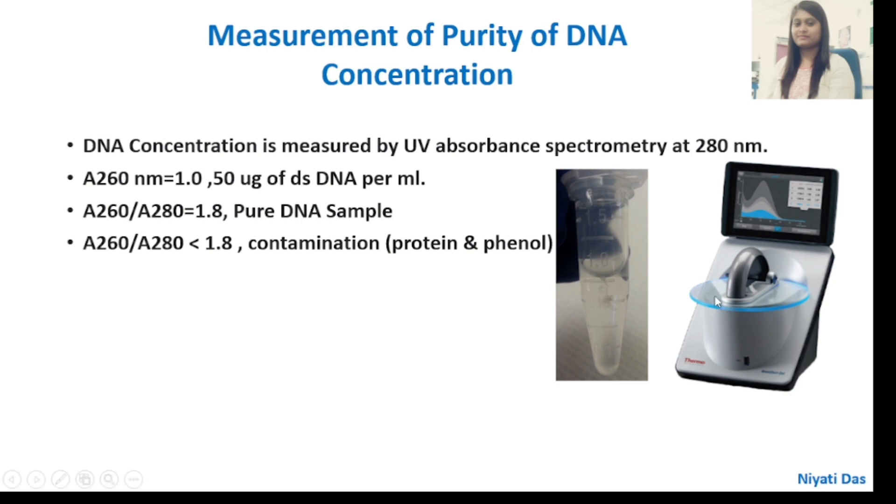The instrument used is the NanoDrop, where we can check the concentration and purity of DNA, RNA, and also protein. Here I am showing the tube containing the DNA. According to the concentration and quality of the DNA, if I can see that there is some thick DNA, I can add up to 100 to 200 microlitres of nuclease-free water.